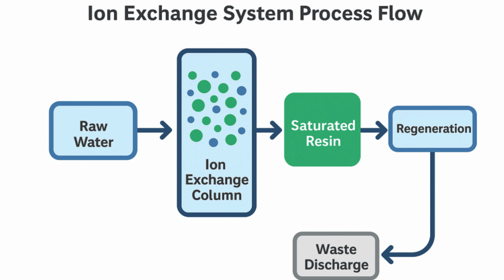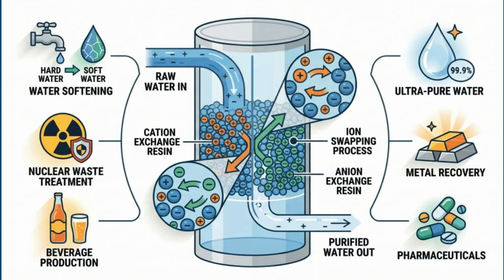Use an approved hazardous waste contractor when required. Document resin identity, operating history, and contaminants captured, particularly for metal, radionuclide, or PFAS-loaded materials. For radioactive applications, additional controls are required because regeneration may produce a highly concentrated radioactive liquid, while the spent resin itself can remain radioactive. EPA documentation describes treatment, controlled storage, or disposal as appropriate management pathways.